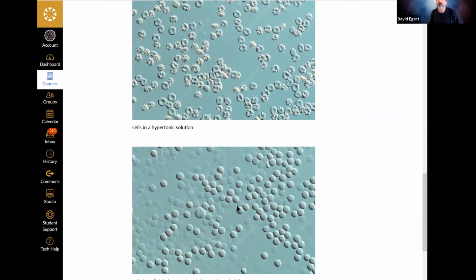Hemolysis. Yeah. So what would this look like under the microscope for tube 1? Clear. It'd be pretty much clear. You wouldn't see much of anything. Maybe you'd see some little fragments of stuff, but in general, you wouldn't see it. Kind of like my analogy of walking into the room, scanning around for the balloons, but you don't see them because they're all just popped.